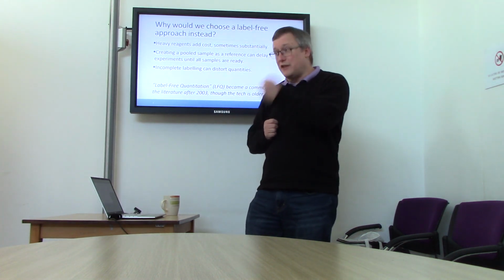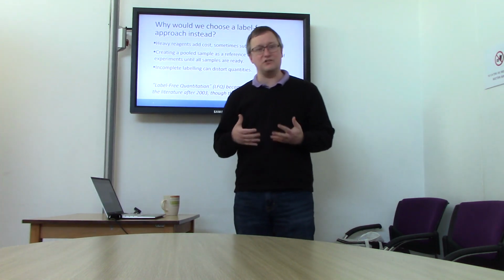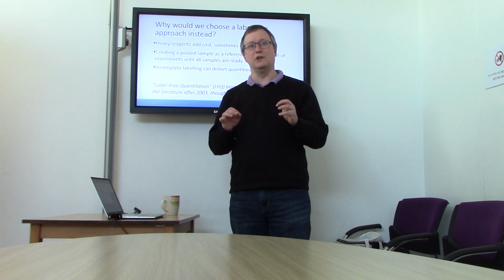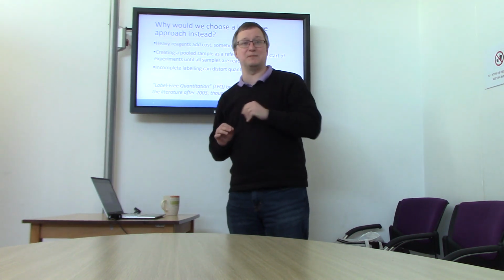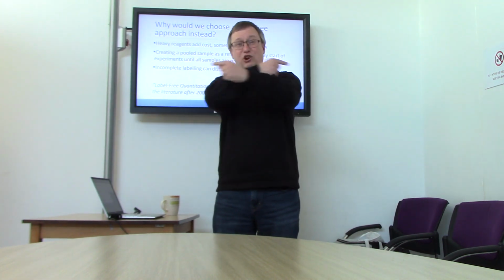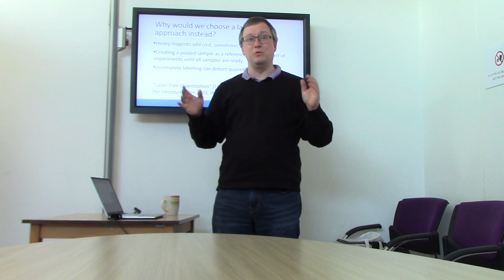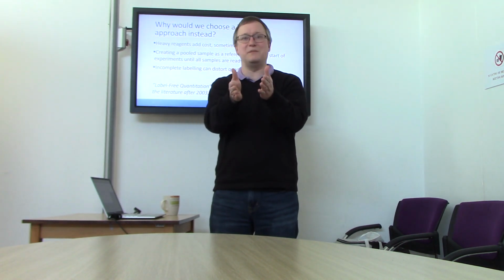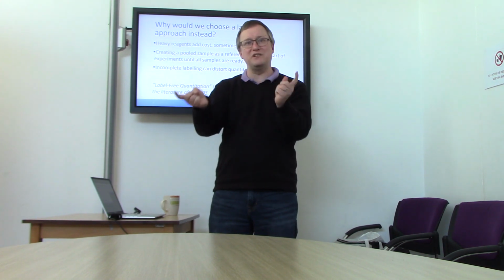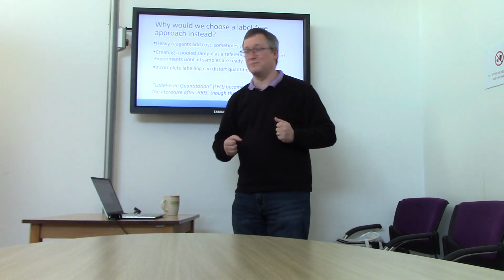So rather than pursuing, say, the iTRAQ route or the SILAC route, someone might try to do quantitation that puts one sample in each LC-MS experiment and makes comparisons across experiments instead. So now we don't have the ability to compare within a single raw file, within a single LC-MS experiment. We need to compare data across LC-MS experiments to compare samples.